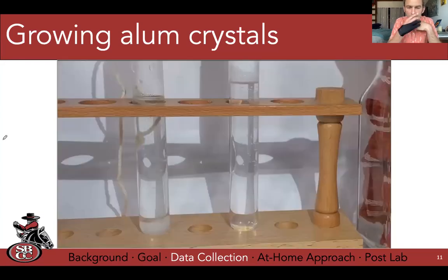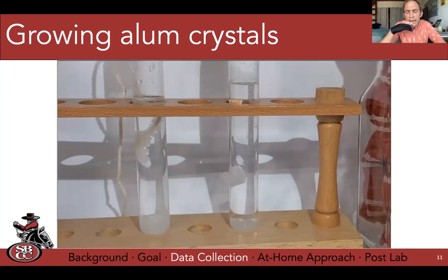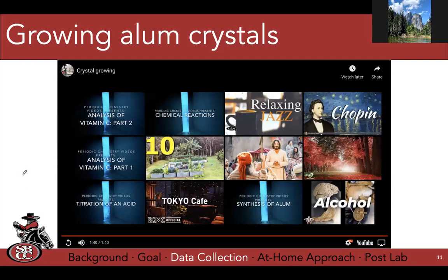So let's just watch the stop motion go, because it's fun. You can see the seed crystals growing out. As Elliot pointed out, you can see all this nucleation happening on the string. So you can actually utilize that fact. Here you can see that it's all growing on the single crystal, but it's starting to get frayed at the edge. What do you think this fraying is coming from here? Anybody have an idea why this crystal might grow a little bit more jagged? Maybe it's cooling too fast, right? So let's take a look at our, yeah, Sophia.